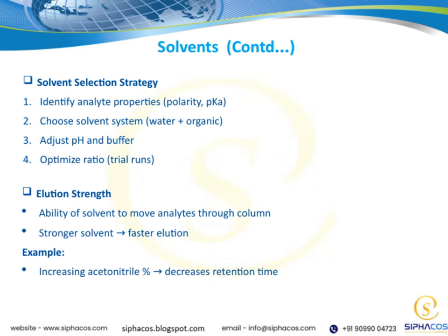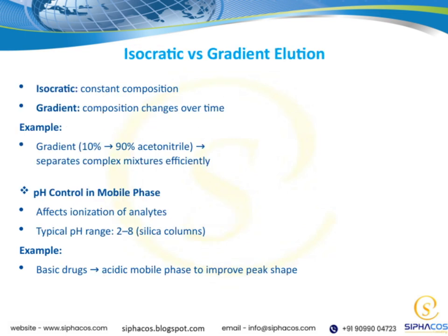And of course, solvent choice can be expanded further, as different solvents have different strengths and effects on the separation process. Overall, selecting and adjusting the right solvent system is crucial for optimizing our chromatography performance and achieving clear, efficient separations.